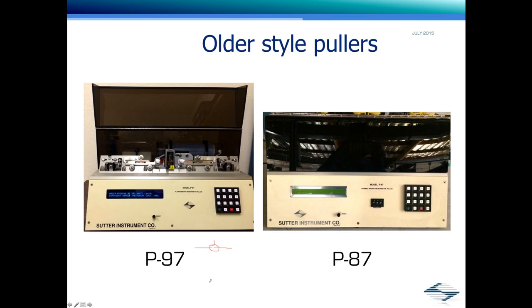I've done it a few times. It's pretty difficult. Usually it's good to get that puller in and we can set it up and put it back to factory specifications and send it back to you repaired, tuned up and polished. A good diagnostic tool for this might also be the video on our YouTube channel, checking the puller bars, because it's entirely possible that somebody tried adjusting the V-groove bearings.